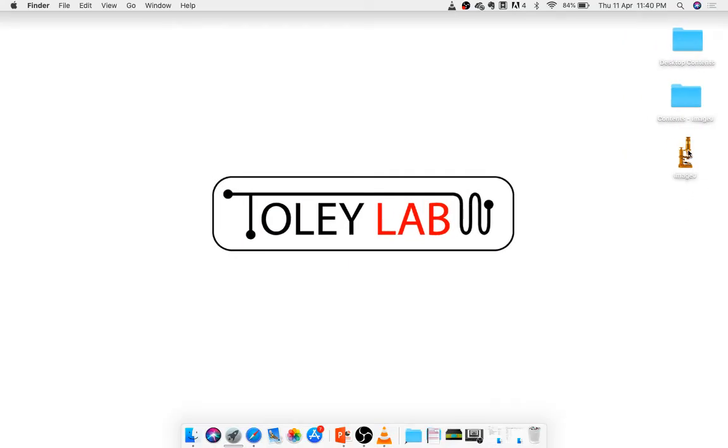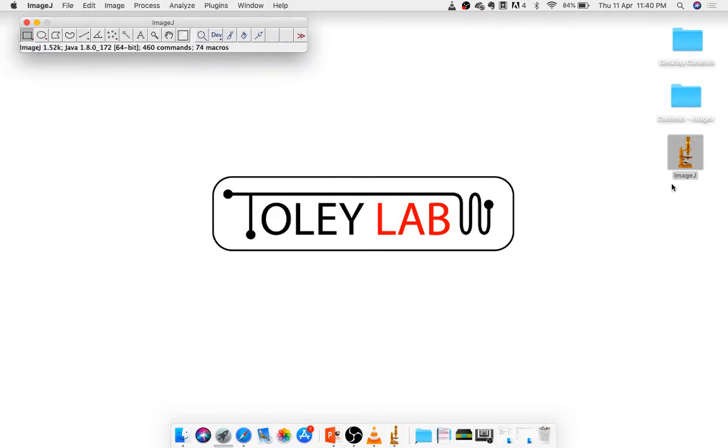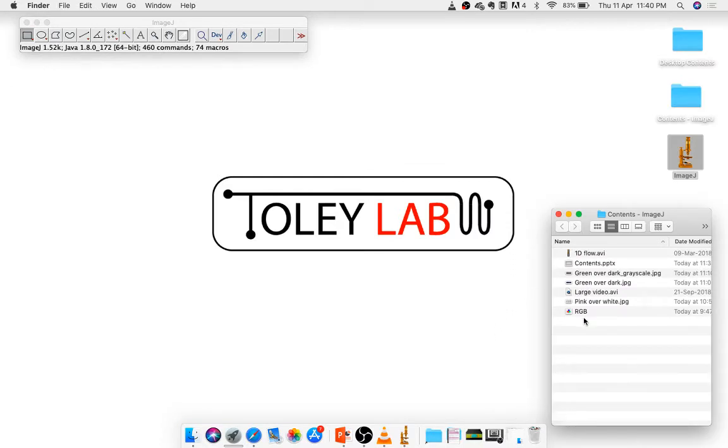I will start by opening ImageJ, which always has this microscope icon. This ImageJ, by the way, was developed by the National Institutes of Health within the United States as an open source project. It's one of the most successful open source software for the scientific community. I have a folder open here where I have all the files that we will need for this tutorial.